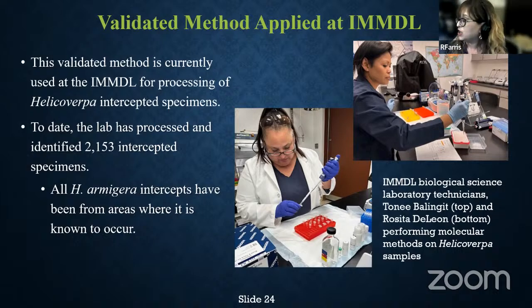I do have some images here of 2 of our biological science technicians, Rosie and Tony, who have been heavily involved in performing the DNA extractions for these Helicoverpa immatures and the real-time PCR assays at our laboratory.